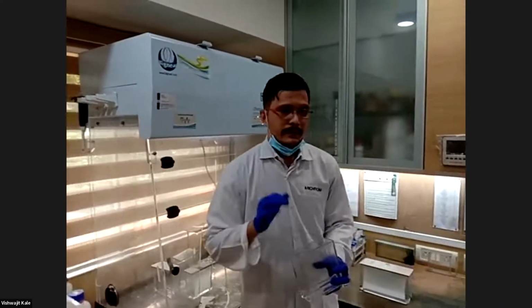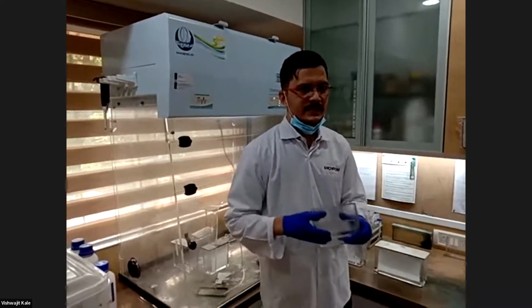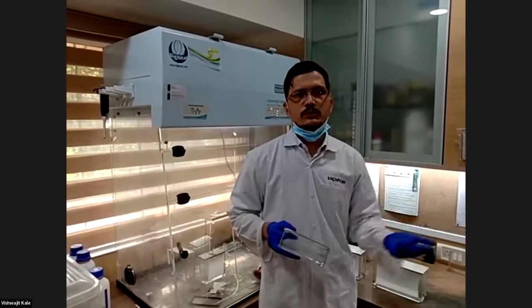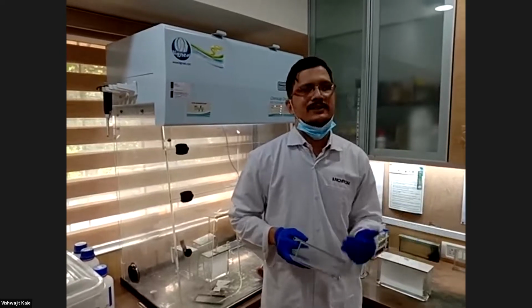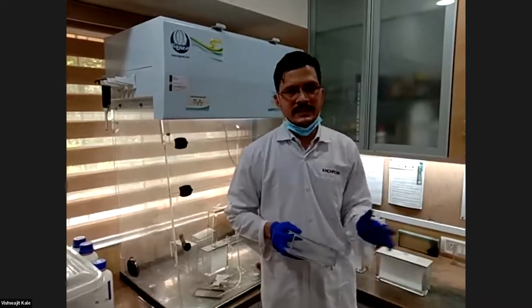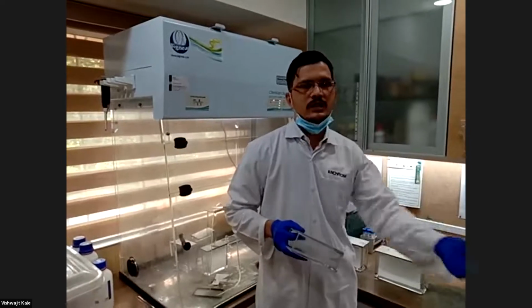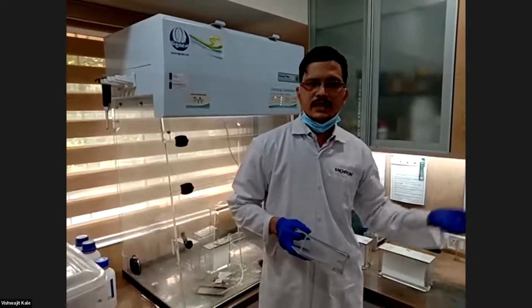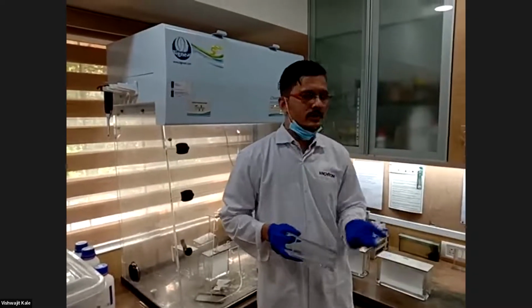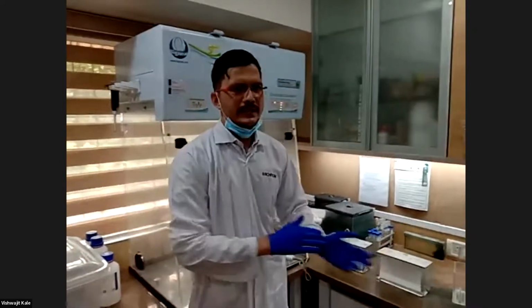So this is about manual development of the plate. Twin trough chambers, Camag twin trough chambers we can use. This is not like any other flat bottom chamber where more volume of mobile phase is required to develop the plate, and no control on development and saturation is there in flat bottom chambers. And we can't achieve reproducible results plate to plate if we use a flat bottom chamber with no fixed methodology. We can't develop reproducible results. This was about manual development.